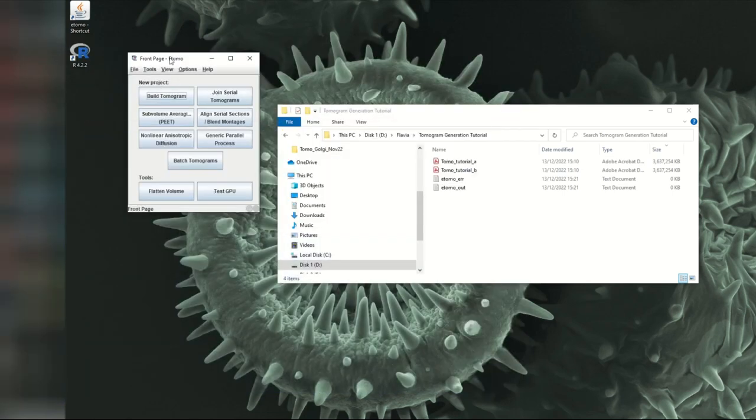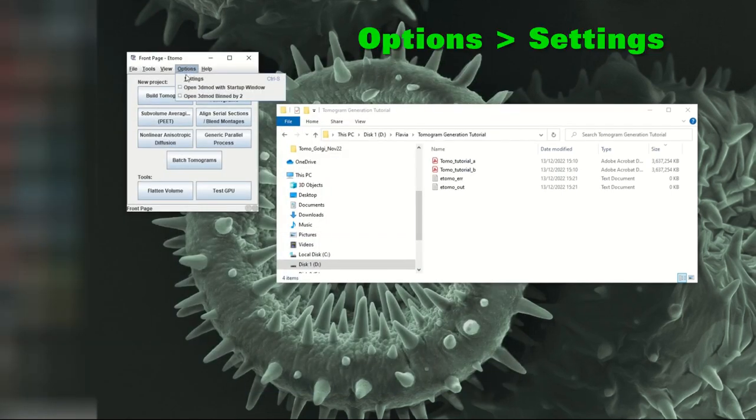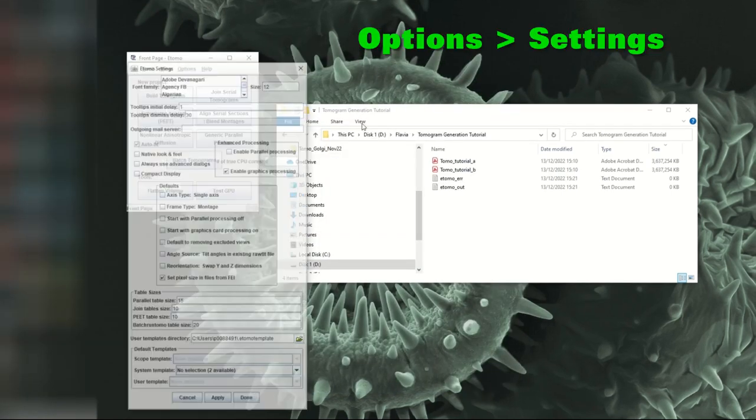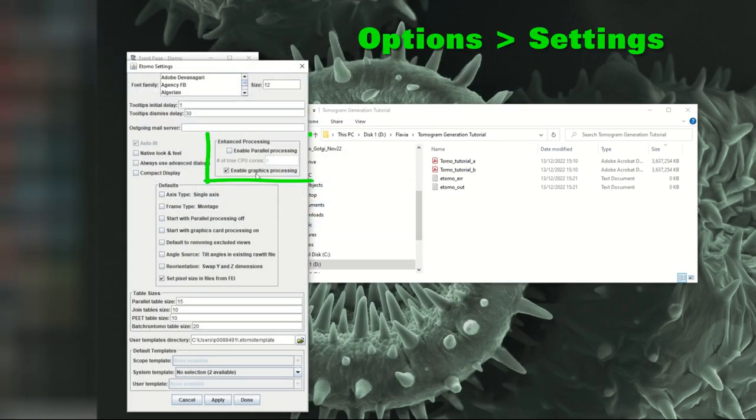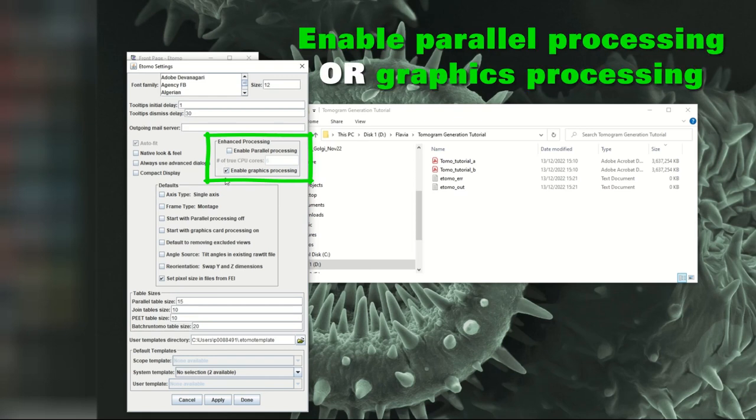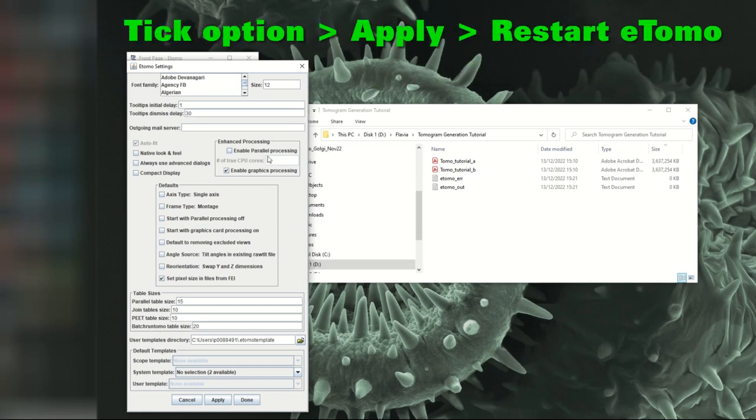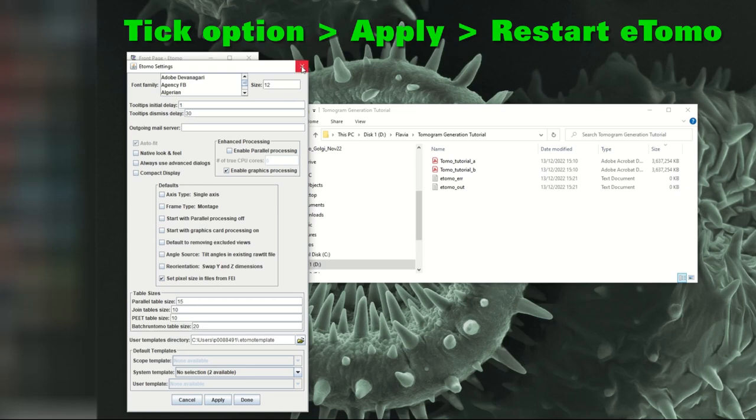So now eTomo is open. First of all, always check that in the settings you have either parallel processing or graphics processing enabled. It depends on your computer really whether you've got more cores. If you haven't got these ones ticked, then you need to tick them, click on apply and then restart eTomo before starting to process your tilt series.